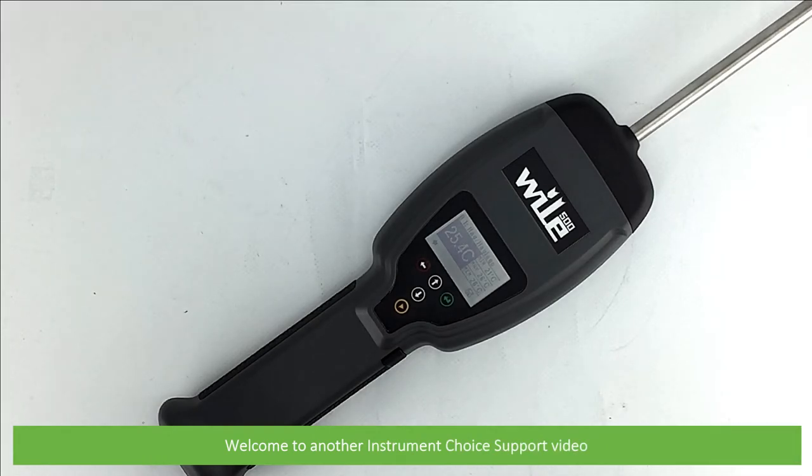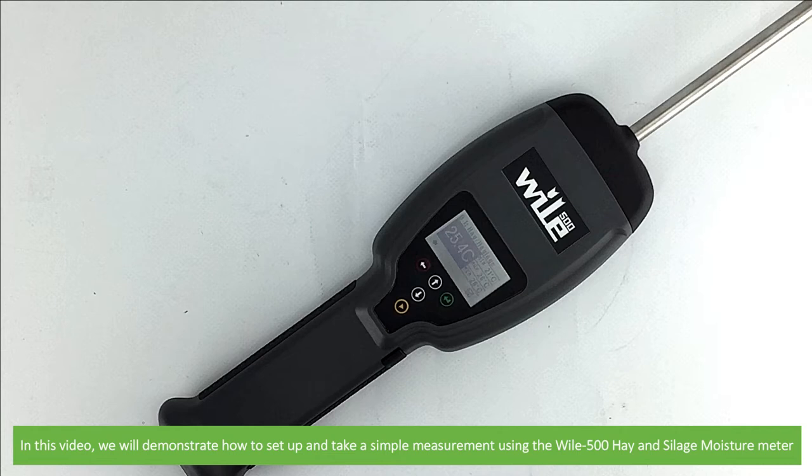Hi and welcome to another Instrument Choice support video. In this video we'll demonstrate how to set up and take a simple measurement using the Wiley 500 Hay Moisture Meter.